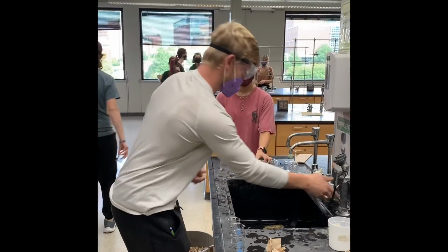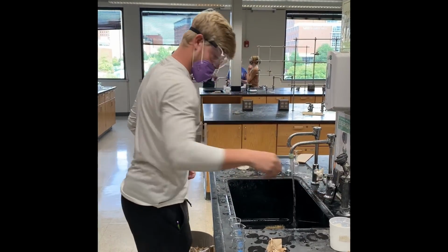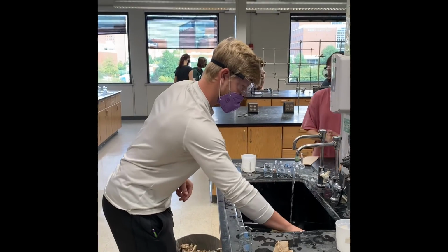Now we're cleaning up. Always make sure when you're finishing a lab to clean your area. Pour out any unused fluid that can go down the sink, and make sure to simply wipe down your lab table when you're finished.